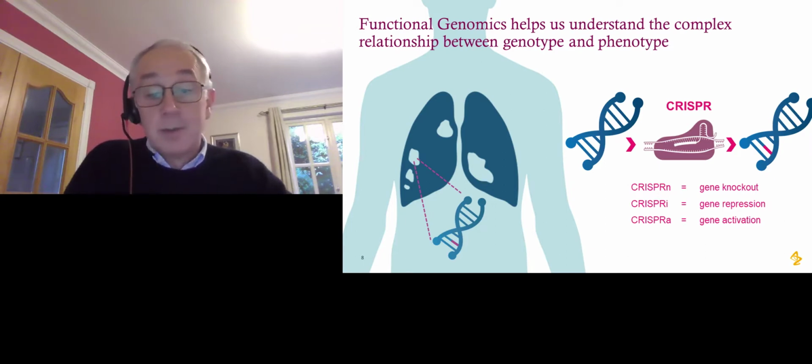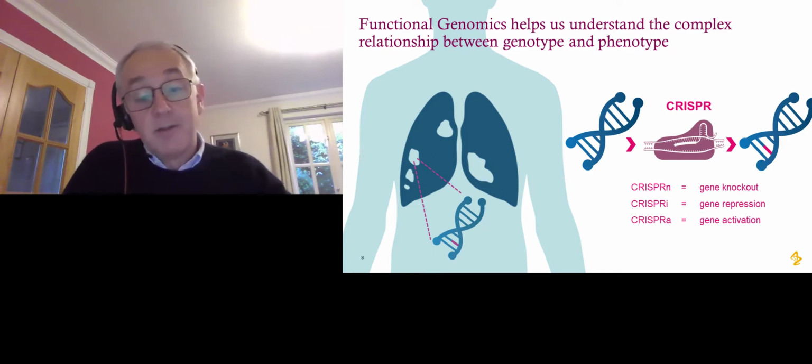And what we're able to do in terms of functional genomic libraries is we can create libraries of CRISPRs in microtiter plate format such that each well contains a guide RNA that is targeted to a specific gene, and we can then screen those guide RNAs exactly as we've always been screening compounds to delete each and every gene in the genome on a one-by-one basis.